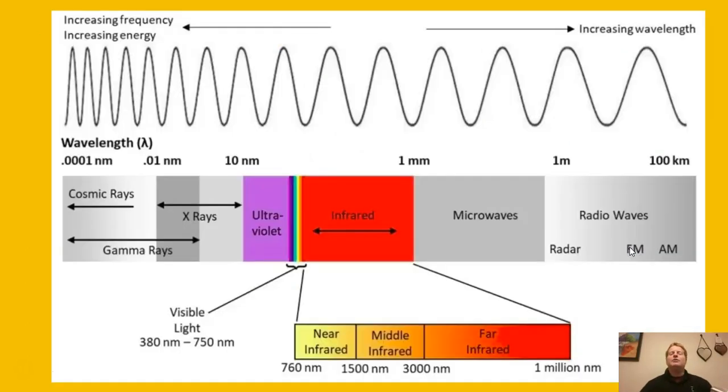Okay, so let's get to the infrared spectroscopy. First thing, and we don't want to know all of these details, we just want to get the general idea about this. Infrared light is a region of light that has a certain wavelength, so a certain distance from wave to wave, and a certain frequency associated with it. And there's a range of infrared light frequencies that you can have. For example, you can have shorter and longer that all fit within what we call the infrared range. What we're going to be looking at is that we apply specifically infrared light to the substance, and then the substance will either absorb portions of that light or not, and give us a certain output, which we'll be checking out in a second.